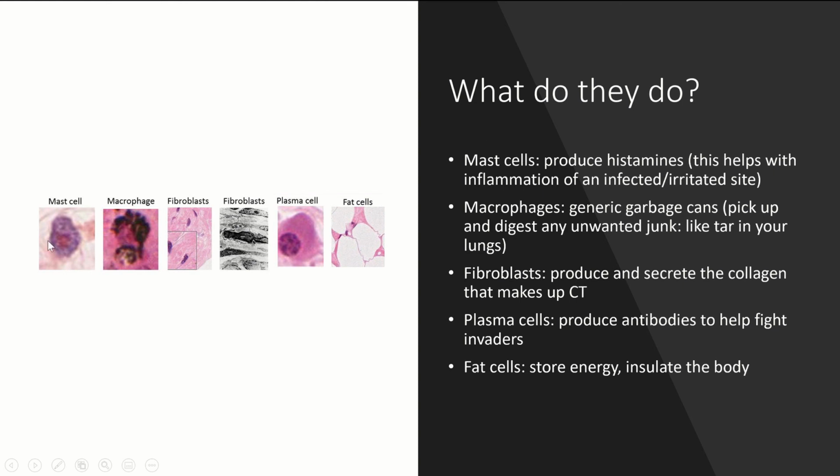So when you find a lot of mast cells, they're not very common. When you find a lot of mast cells, it tells you that some kind of inflammation, some kind of infection, some kind of irritation is going on in that site.